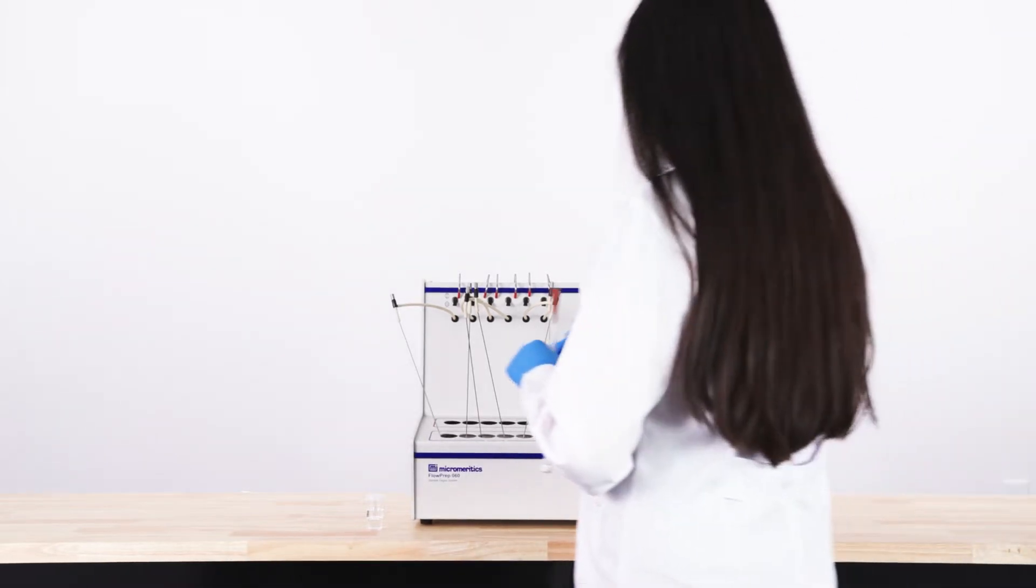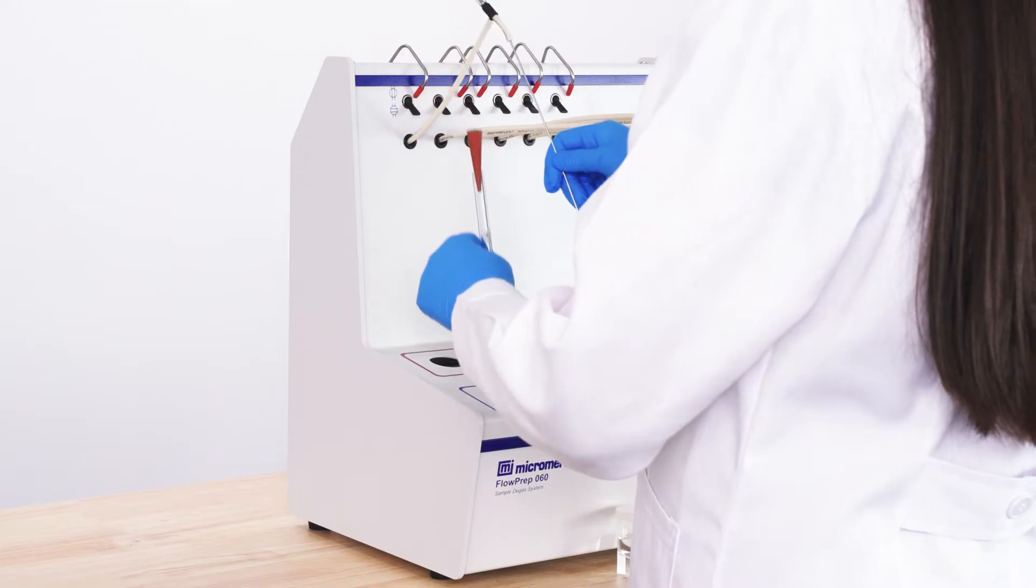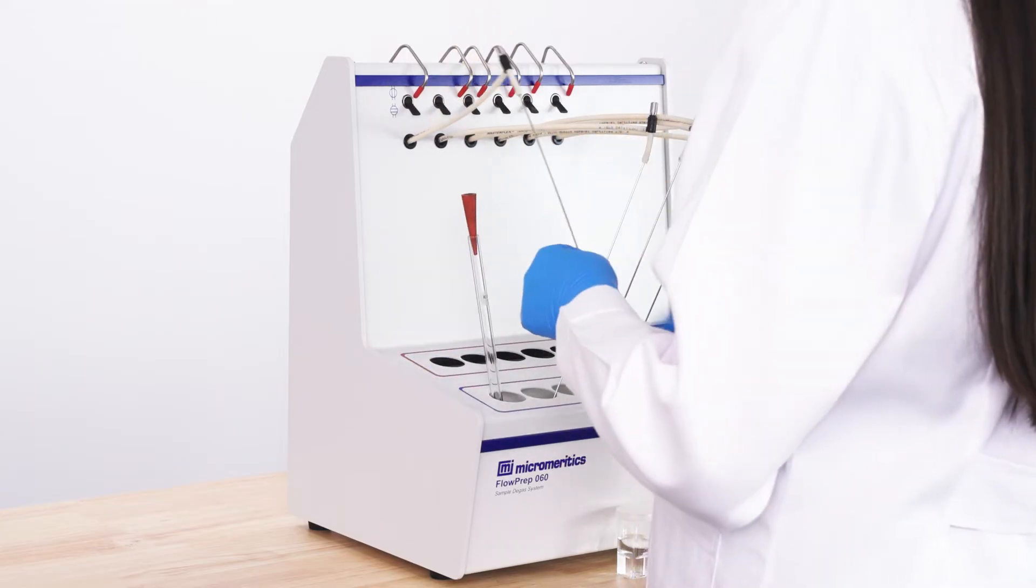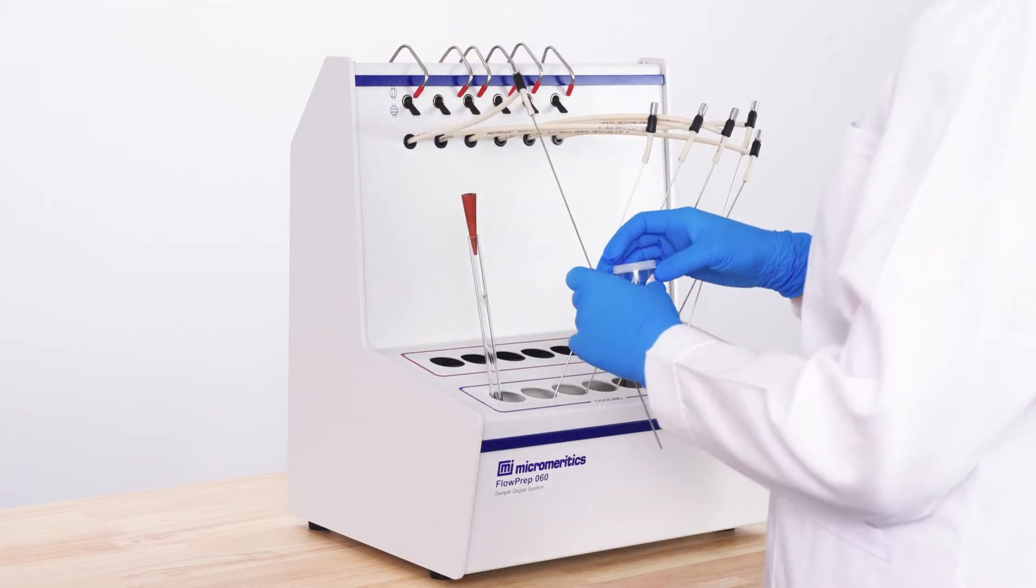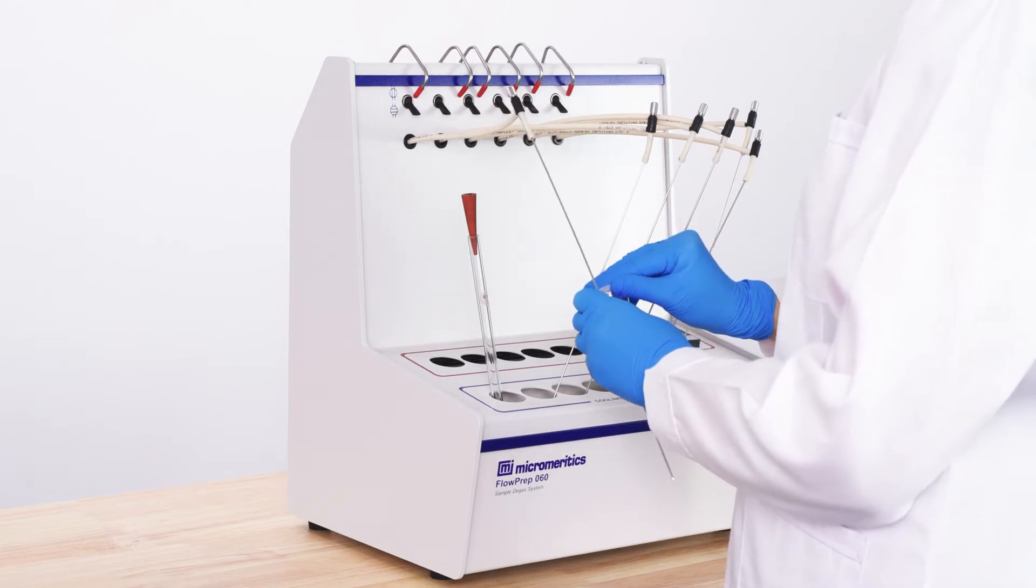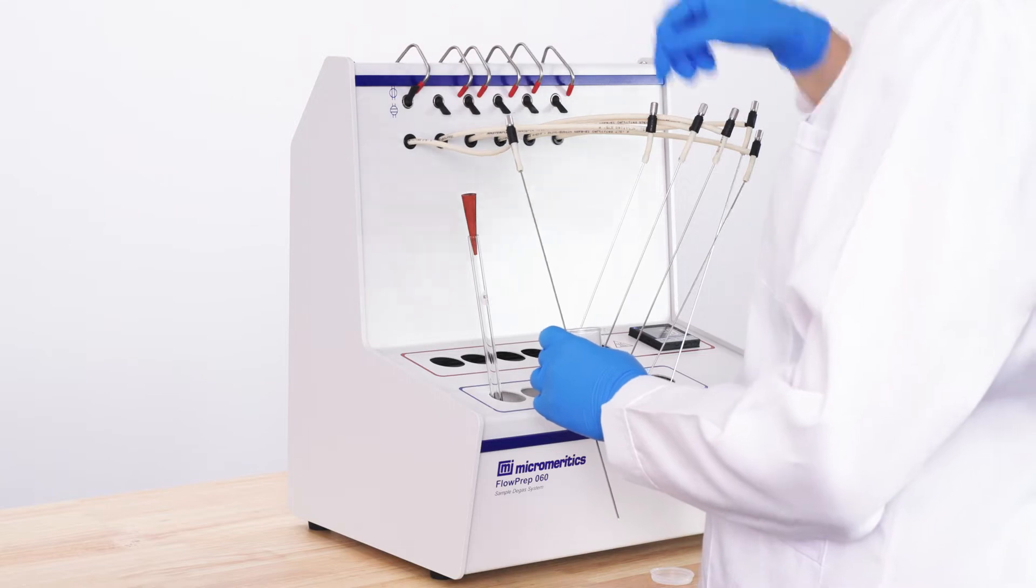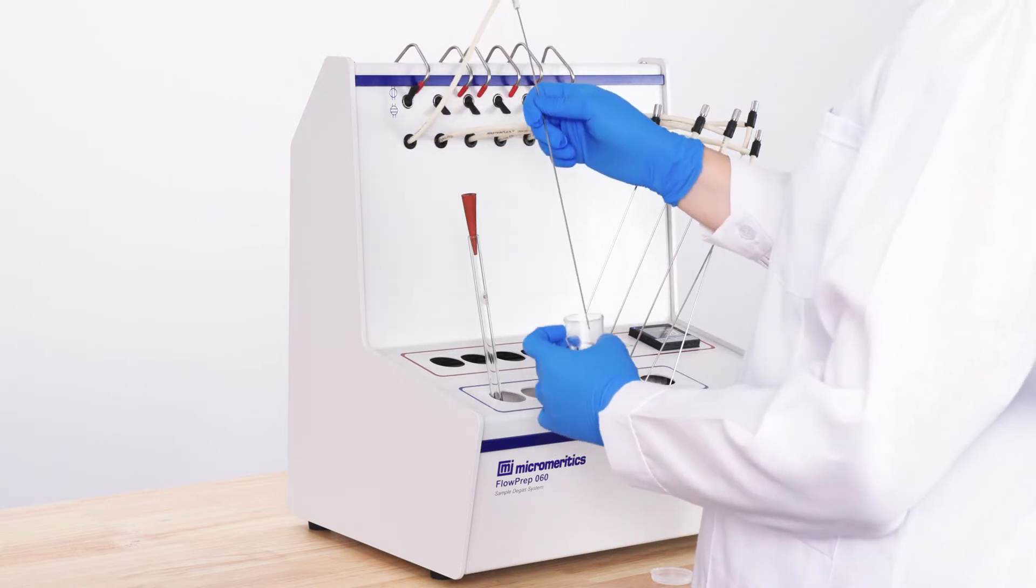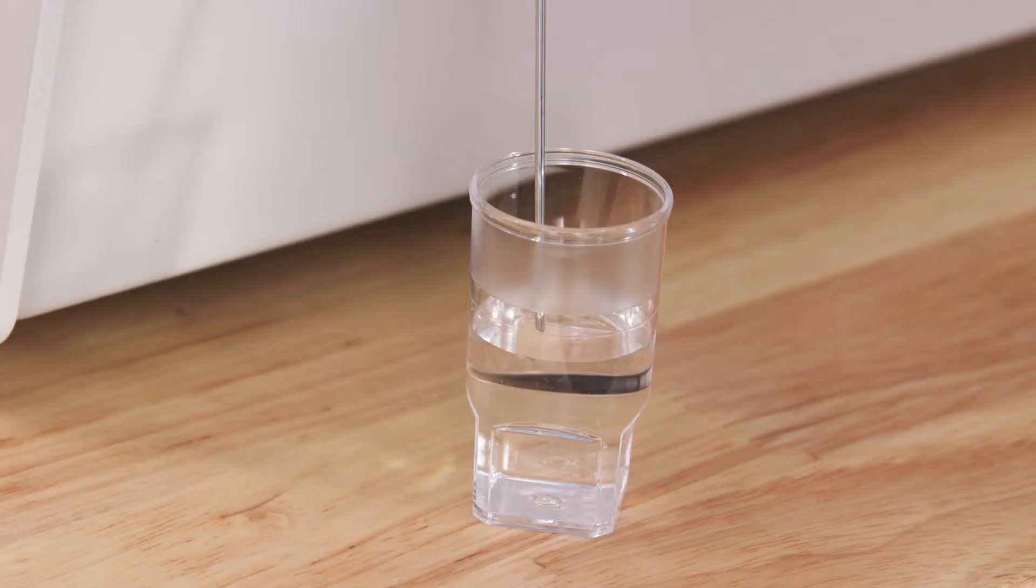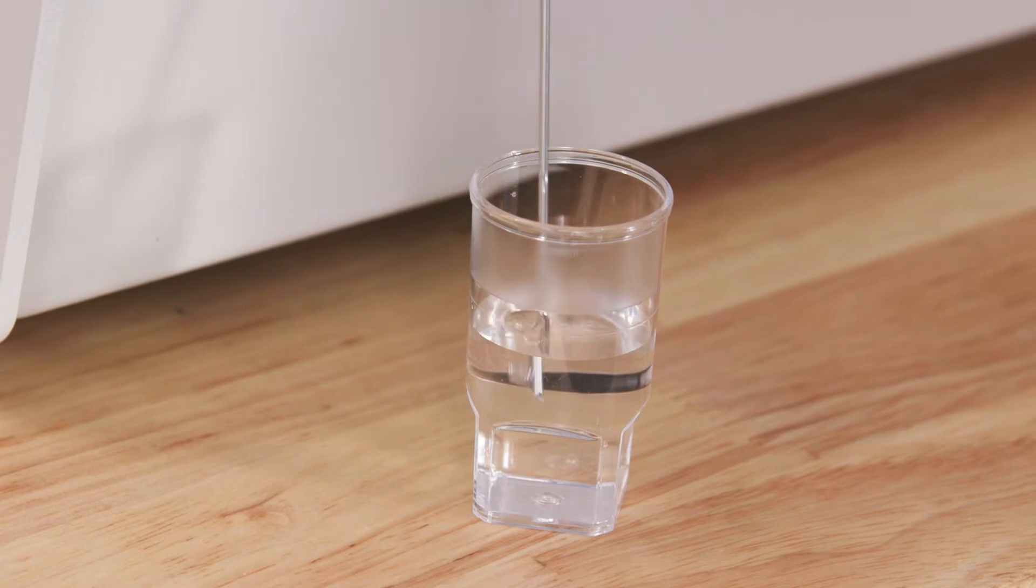On the FlowPrep, set the sample tube in the cooling station and turn on the gas. Immerse the tip of the gas delivery tube in water to check the flow of nitrogen gas. Flip the switch at the top of the instrument upwards to allow gas to flow. Bubbles should rise from the gas delivery tube in the water indicating that gas is flowing.